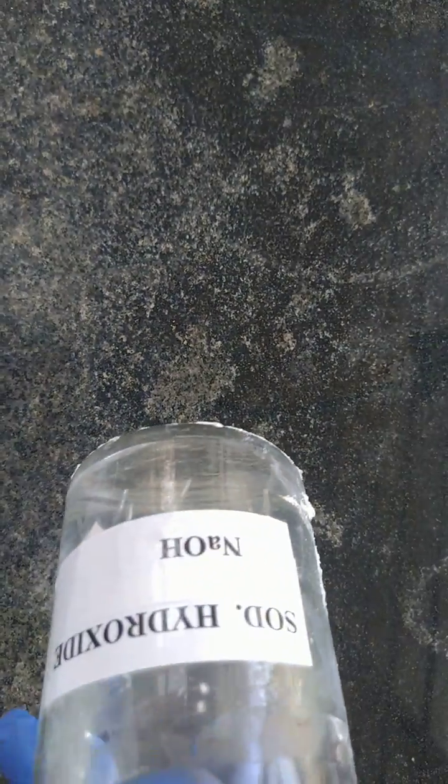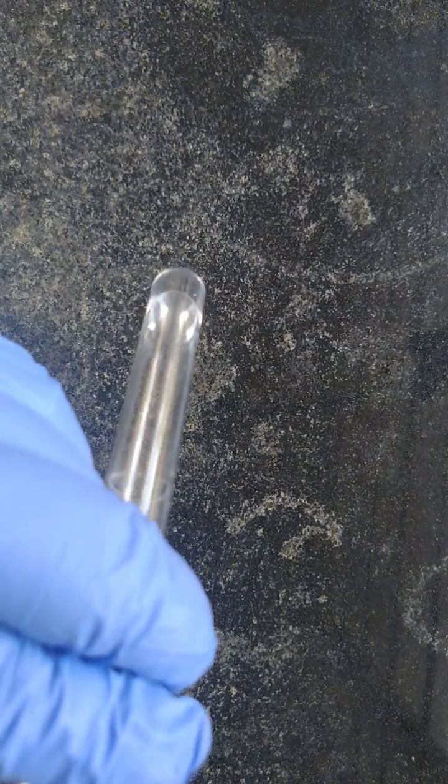I am going to take a test tube and the original solution which we have initially prepared by dissolving the given salt in water. To this I am going to add NaOH, sodium hydroxide, dropwise. Add slowly.